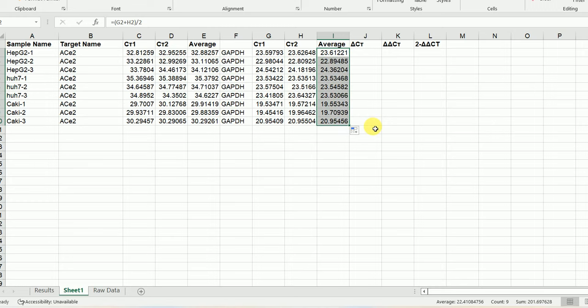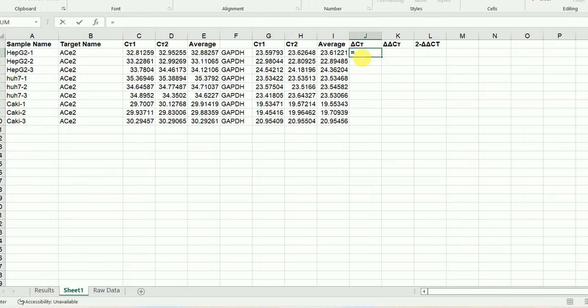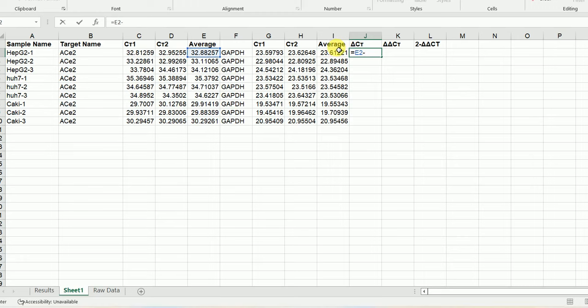Now we have calculated the average Ct value for all samples. The next thing we're going to do is calculate the delta Ct value. What is delta Ct? Delta Ct is basically the difference between the Ct value of the target minus the average Ct value of the reference. ACE2 is our target gene and GAPDH is our reference. We select the average Ct of the target minus the average Ct of the reference, hit enter, and drag it down to the end.